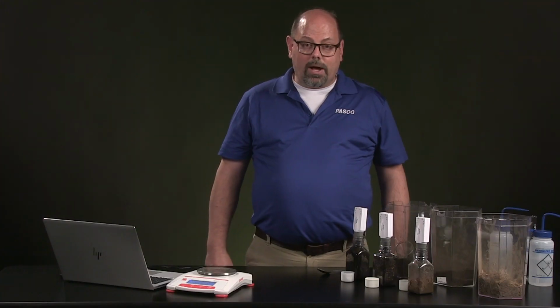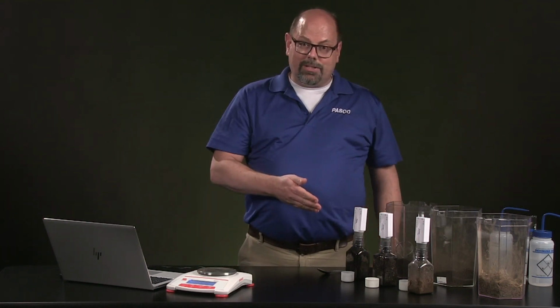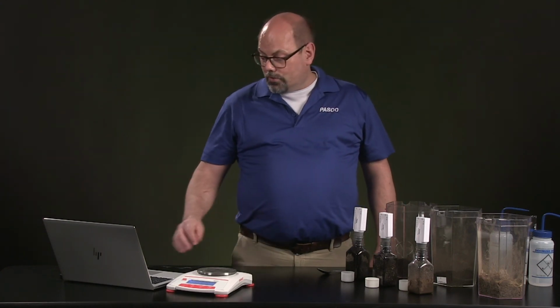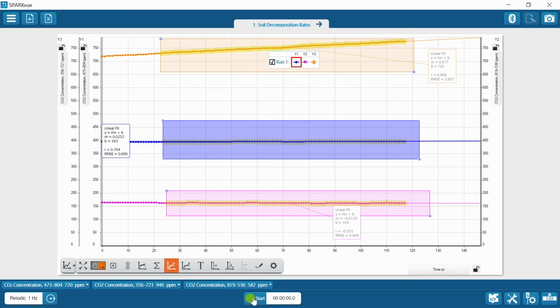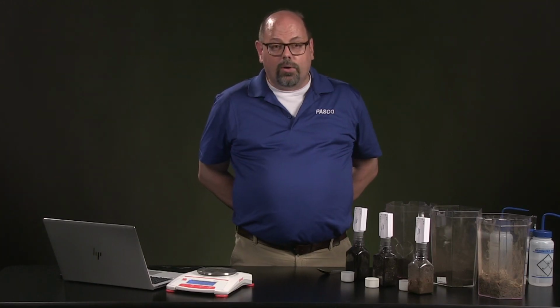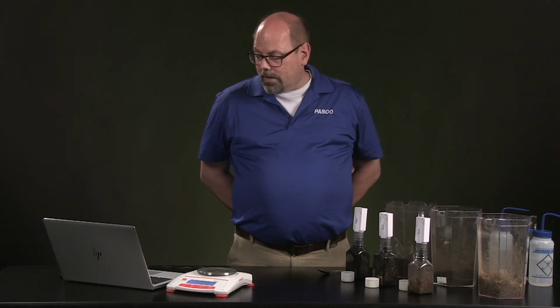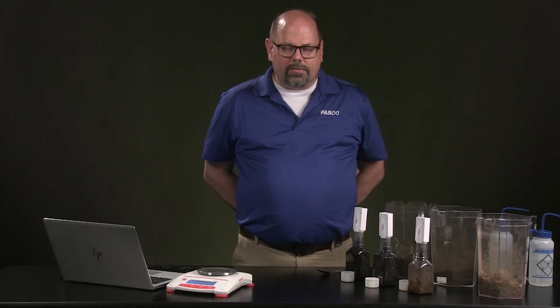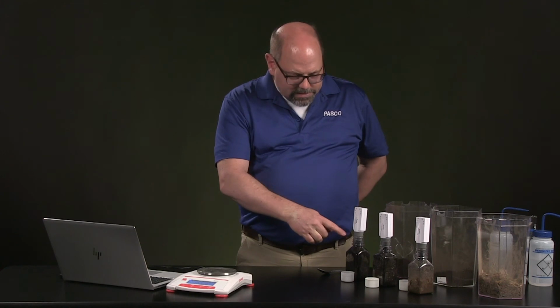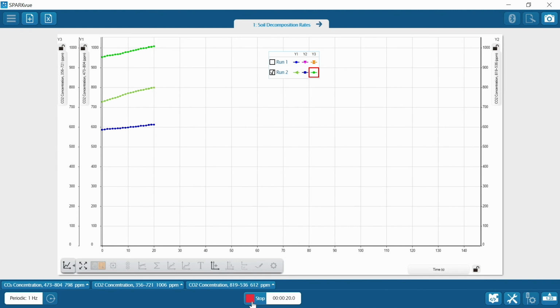Okay, now let's go back to the previous run. That's where we left off. That was the dry materials that's on here. I'm going to hit the start button again, and that's going to start to show us what's happening to the CO2 now that we put water into those soils. And we'll give it, like I said, a couple of minutes. If it looks nice and consistent for that whole time, then we can finish a little earlier, like at 1.5 minutes or something. But I think I want to let it run for up to 3 minutes, because usually if something happens right away, maybe a seal didn't hold, so you let some of the CO2 out, then it's good to take the end part of the run once everything's settled in. So far, they look pretty good.